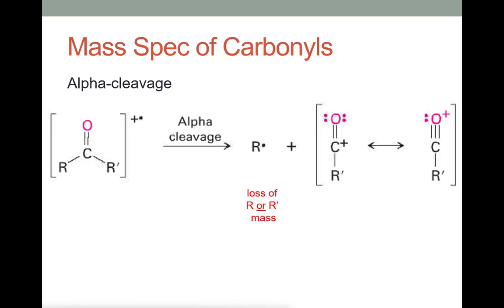Carbonyls do that as well. Again, we can cleave either of these two bonds. So this, what's shown as an R, could be R or R prime. We'll see both of those, both cleavage events. But we're generating a very stable charged particle here.